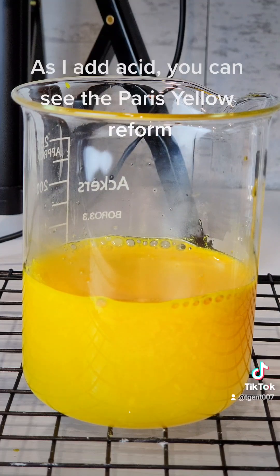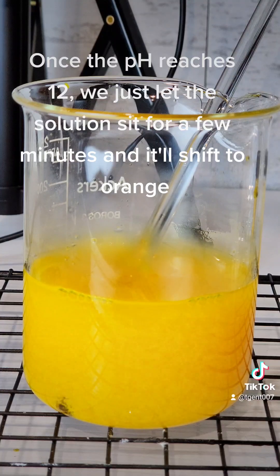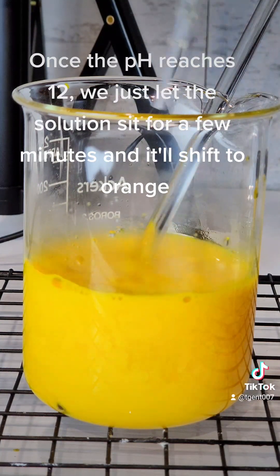As I add acid, you can see the Paris Yellow reform. Once the pH reaches 12, we just let the solution sit for a few minutes and it'll shift to orange.